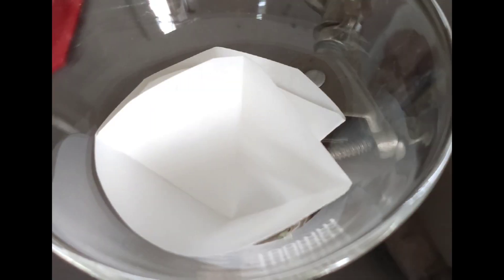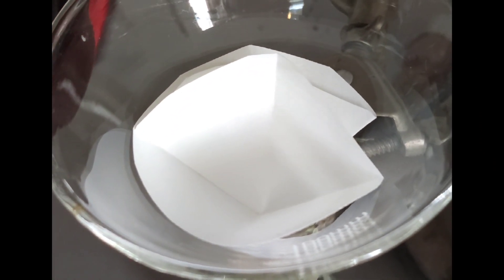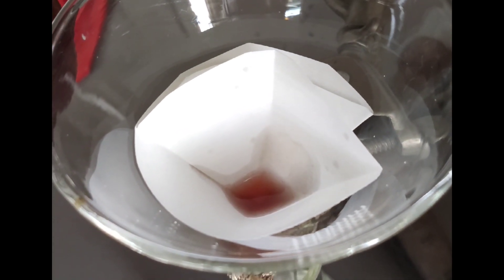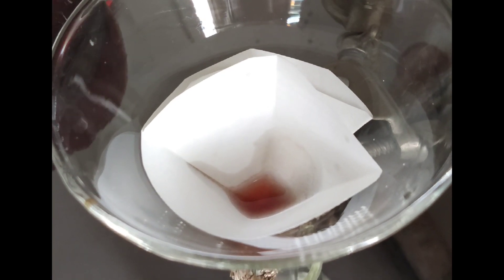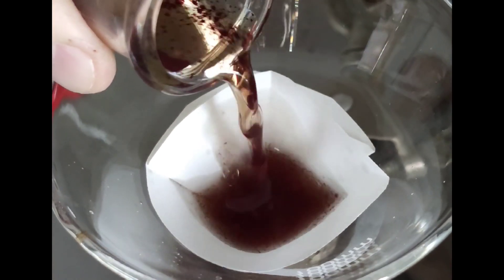After letting the suspension of the cobalt corrole in brine stand for a few minutes, we filter it using a simple filter paper. We add the suspension by pipette slowly. When the filter paper is wet, we can start pouring faster the rest of the flask contents.